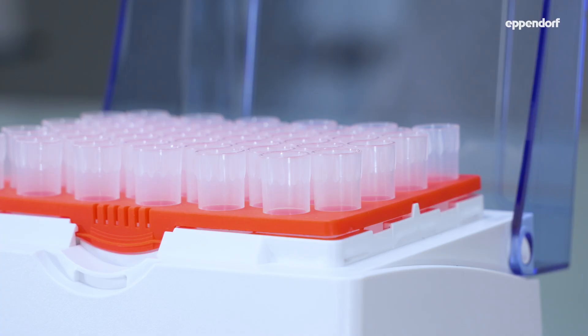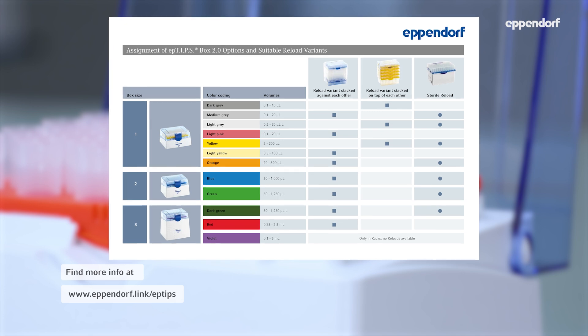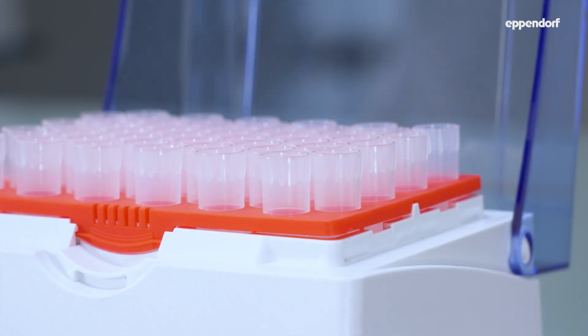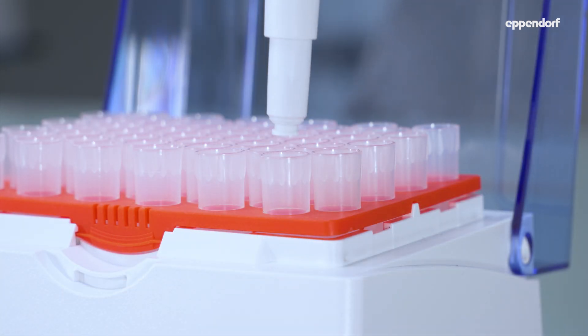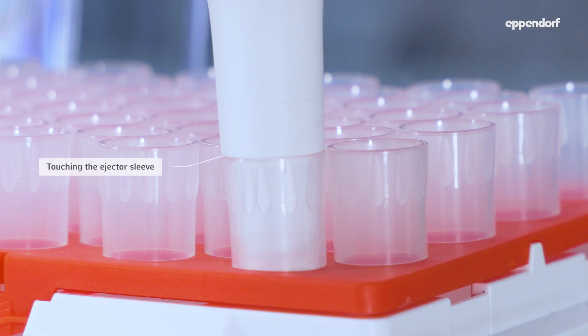Attach a suitable pipette tip. The color code on Eppendorf tip trays helps you to easily identify matching tips for your pipette. Push the pipette onto the tip. Avoid hammering the tip in or rocking the pipette. The tip is securely attached when its upper end touches the ejector sleeve.